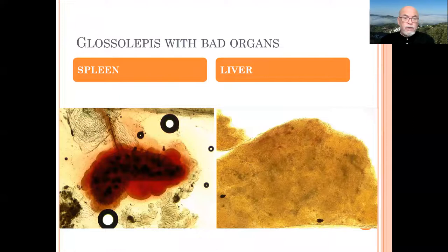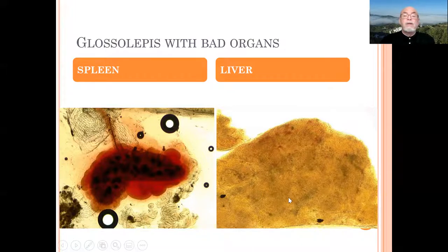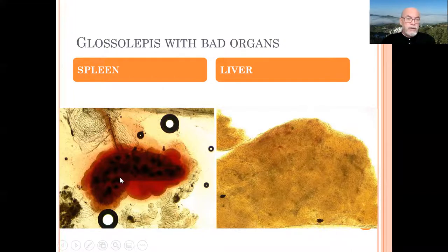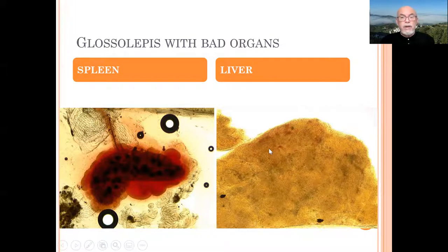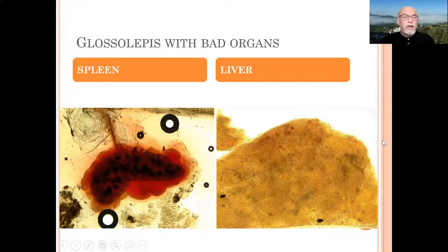When we check the internal organs — the spleen on the left and the liver on the right — you can see the tissue is not normally formed. The spleen has very dark patches, which are called melanomacrophage centers. The liver also has some red bleeding patches, most likely due to the bacterial infection that was already visible on the gills. So this fish also has internal bacterial infections.